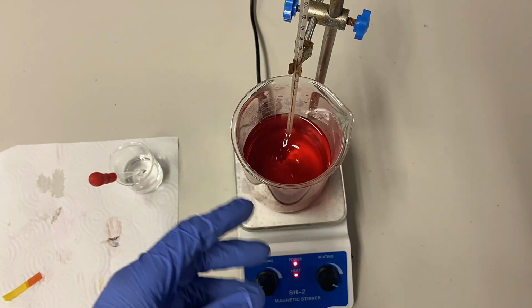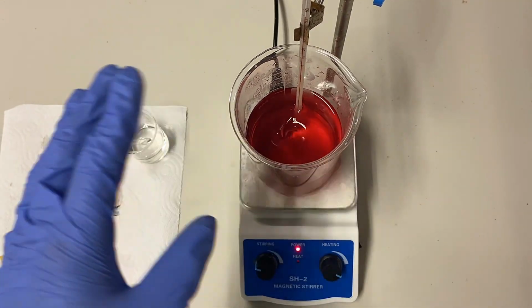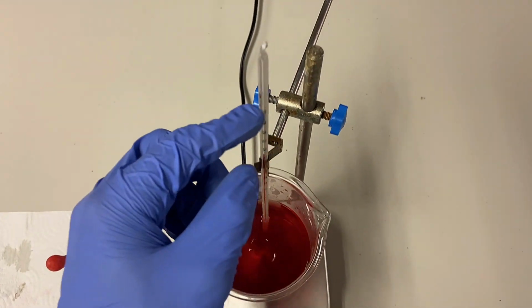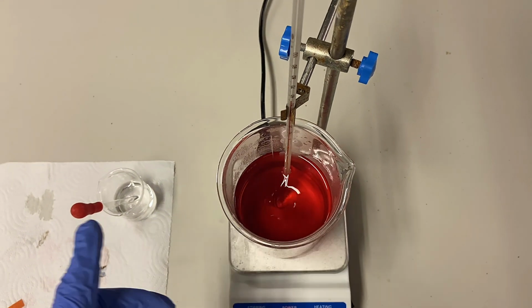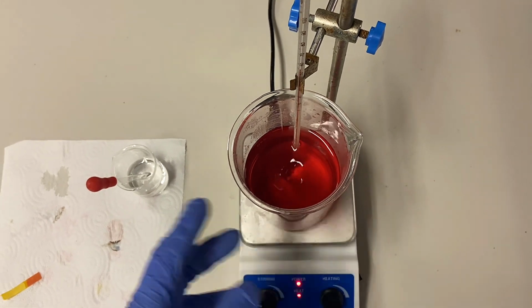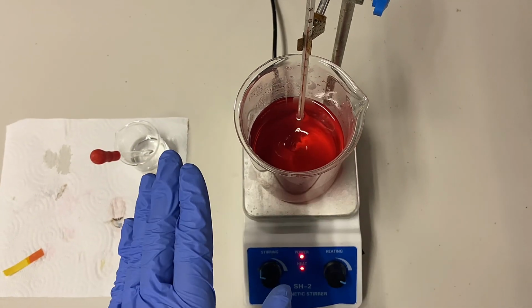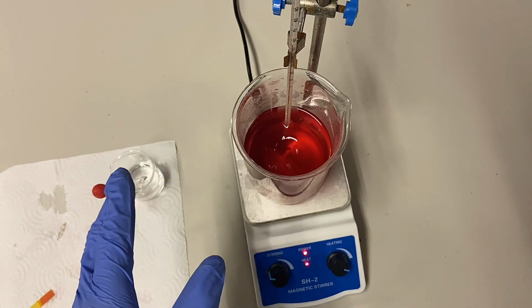And from that point I can keep doing more chemistry, which I'll probably cover in future videos, and get the rest of the stuff. But what I'm doing today is heating this until about 95, 100 degrees. So I've got a little while to wait, stirring it, dropping some of that oxidizer in, and then letting it sit for a good couple of hours to really oxidize everything out, run it through a filter, and I should be left with manganese dioxide. Hopefully. Everything's gone fairly smoothly up until now, so I'm hoping that trend continues.